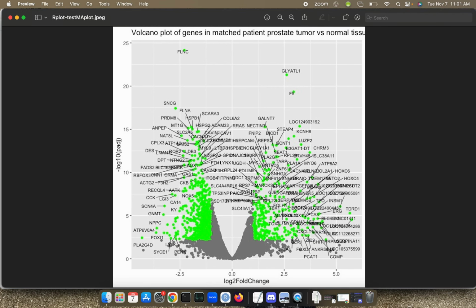So we're getting used to thinking about discussing our data in terms of larger patterns and focusing in on smaller patterns. So the larger pattern that I first notice here is that it looks to me, just visually, that there are more significant down-regulated genes than up-regulated genes. So that's kind of a general pattern you could mention. And then you could talk about specific patterns. So that's where I would then start choosing individual genes to look at closer, look up their biological functions, see how they work.